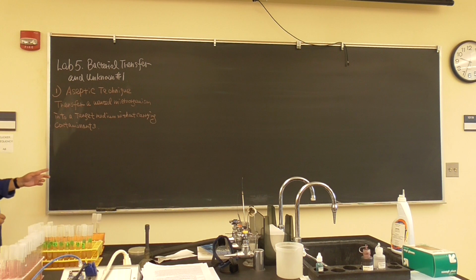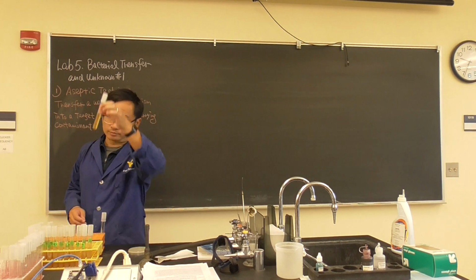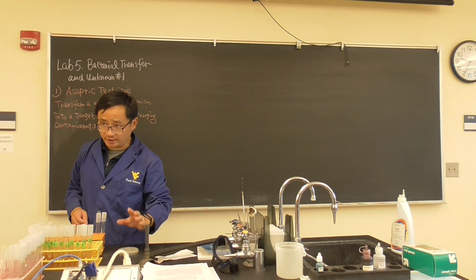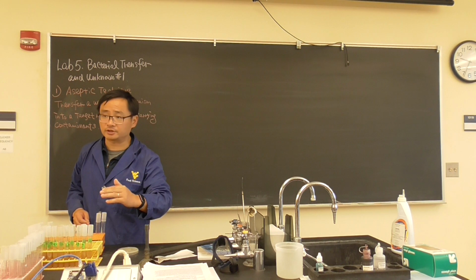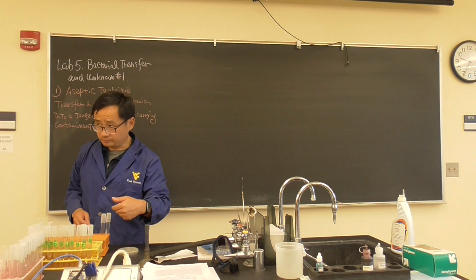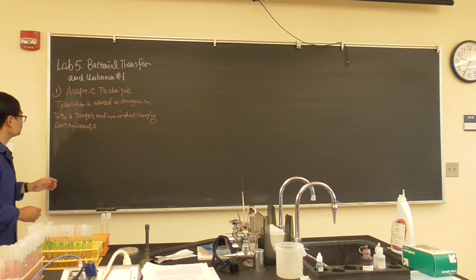So this is very important. If we are transferring a bacteria on a slant, in the broth, or onto the agar plates, if you're transferring E. coli, then you're transferring only E. coli. You're not going to carry bacteria from the air, the bench, or your hands into this medium, because otherwise you're going to get cross-contamination. So that's the aseptic technique, the concept.